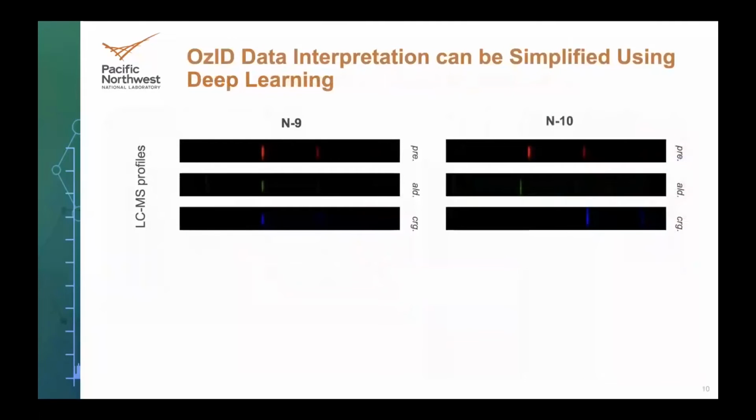Okay, so that analysis is a more standard or traditional approach, basically automating the steps that an expert would take as they sit and work through the data.